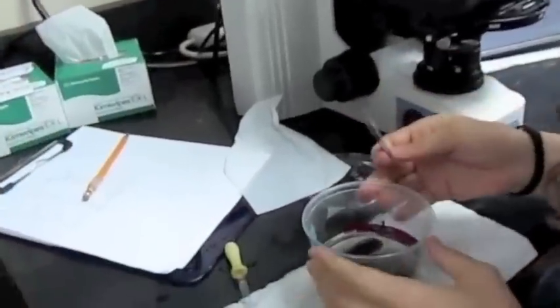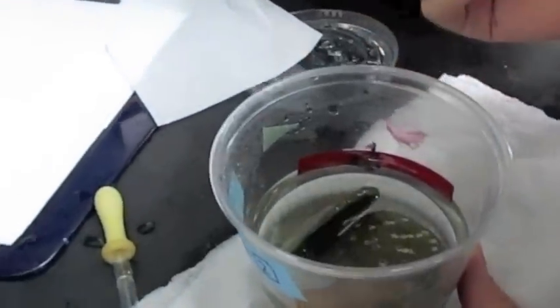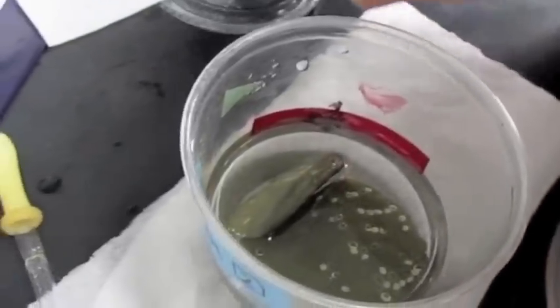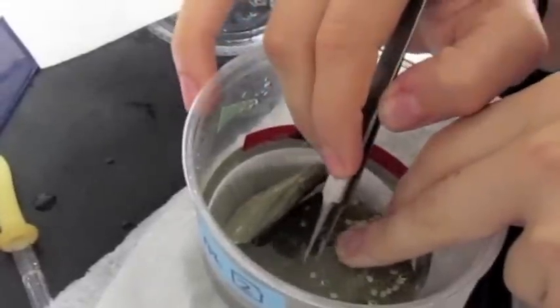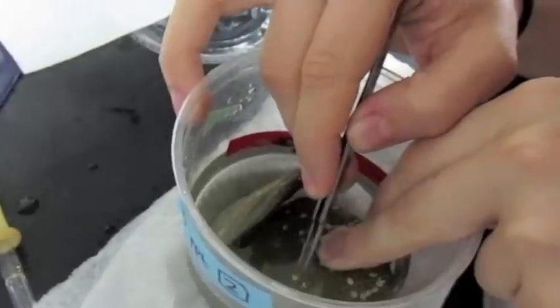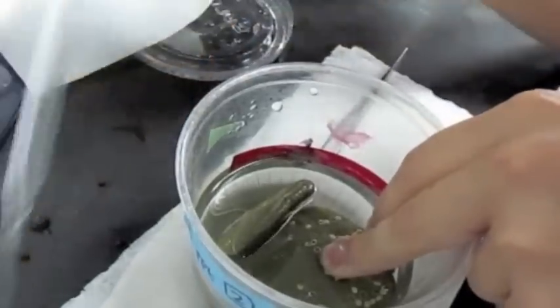Inside each treatment, which is a cup full of seawater, we have capsules on plates that we collected. I'll open three capsules every time I check them with a pair of forceps and suck out the larvae using a pipette. Then I put them on a slide and look at them under the scope.